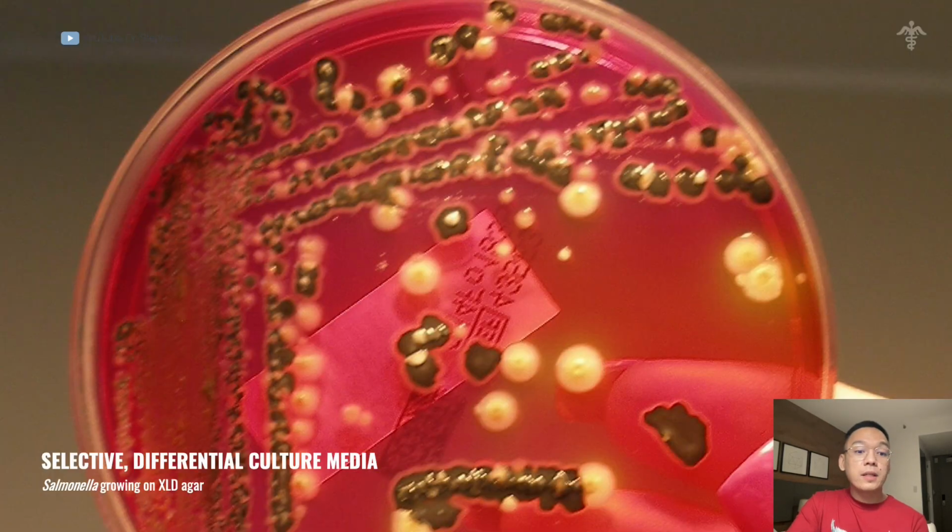plate. Another selective differential culture media is your XLD agar, showing you a salmonella growing here in your XLD agar. These are selective differential agar for salmonella and shigella in enteric culture. So when you say enteric, these are coming from your gastrointestinal tract.